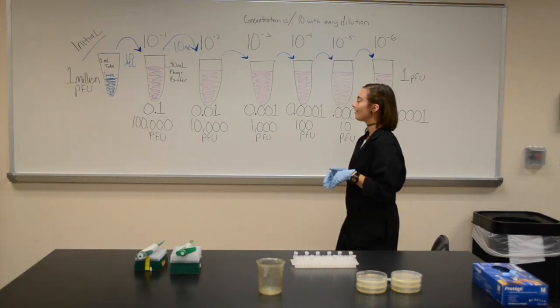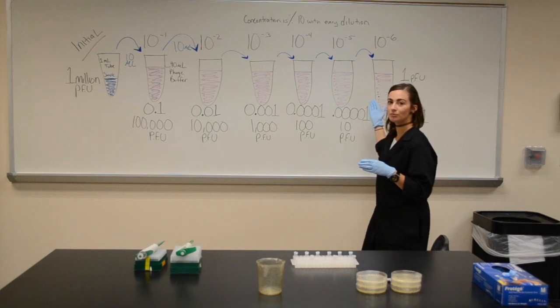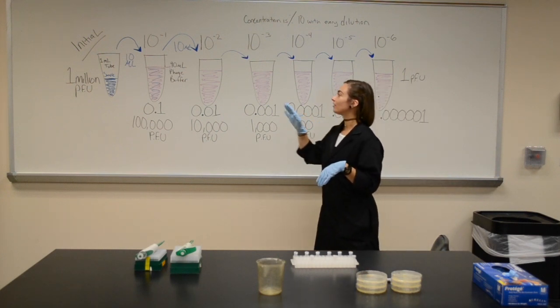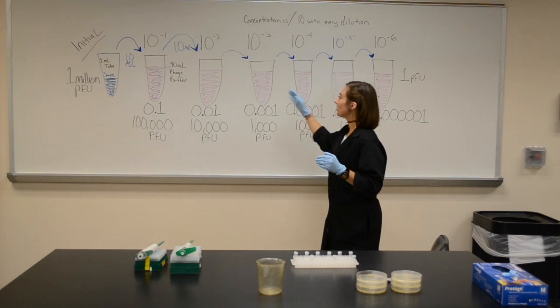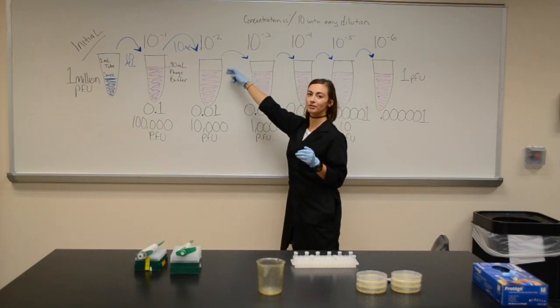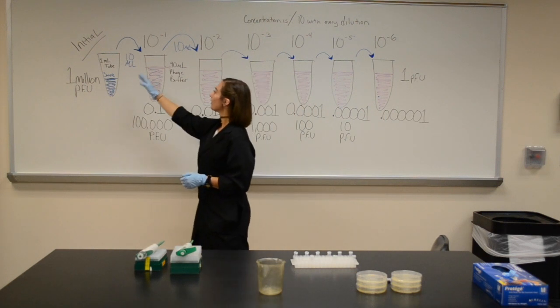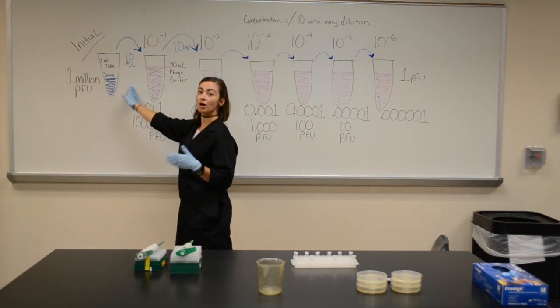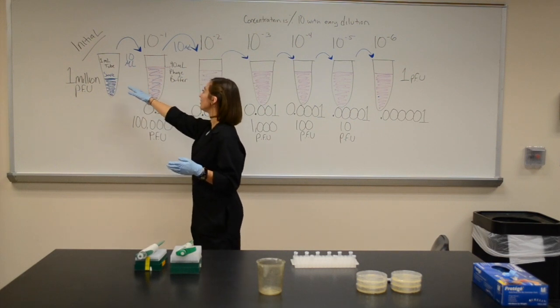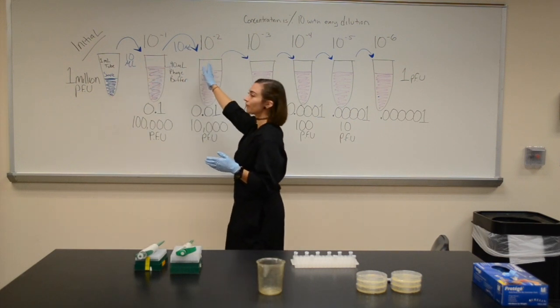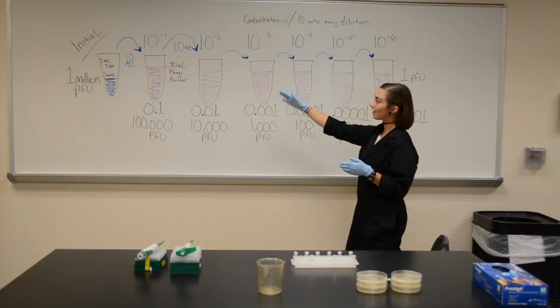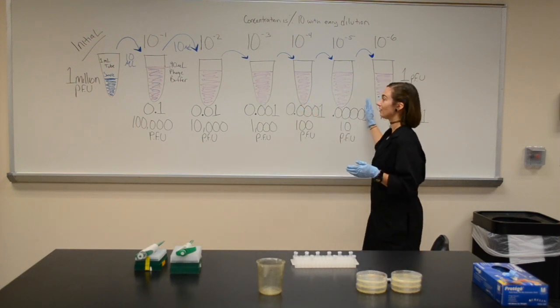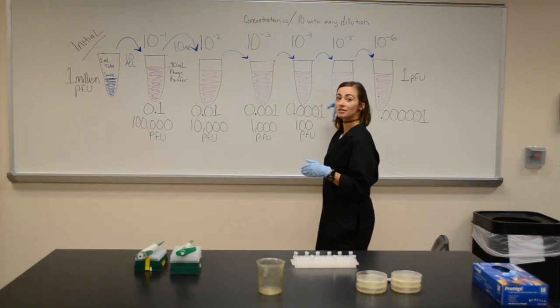So we have six tubes. We'll be starting with seven counting the original sample. Each of the six tubes gets the same 90 microliters of phage buffer, and how we equal the actual 100 microliters total would be moving the 10 over each time. So we're reducing our concentration, dividing it by 10, but keeping the volumes the same.